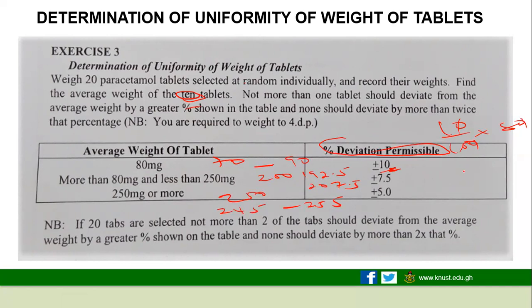And so what we are saying here is that ideally, you either fall below by 8, that is, it should be 72 to 88. Now, this is the accurate range that we are talking about. So if you fall within any of this range, it is fine, right?